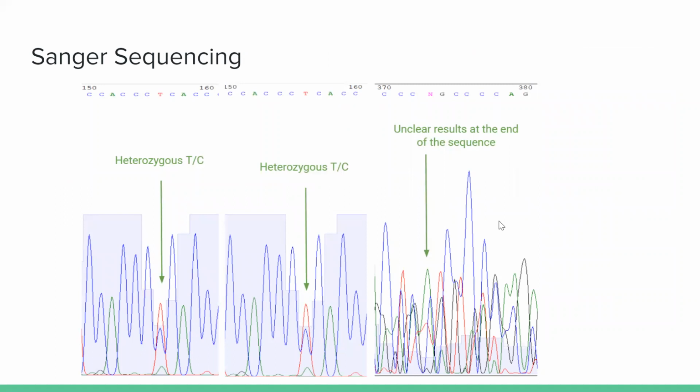As expected, our gene is heterozygous, so the first 2 images are expected and within relatively minimal noise. However, we found that we were unable to conclude the sequence in the last picture because it does have a fair amount of noise and is quite unclear.